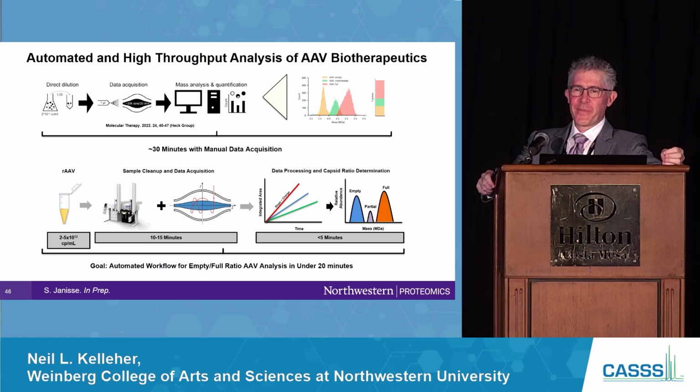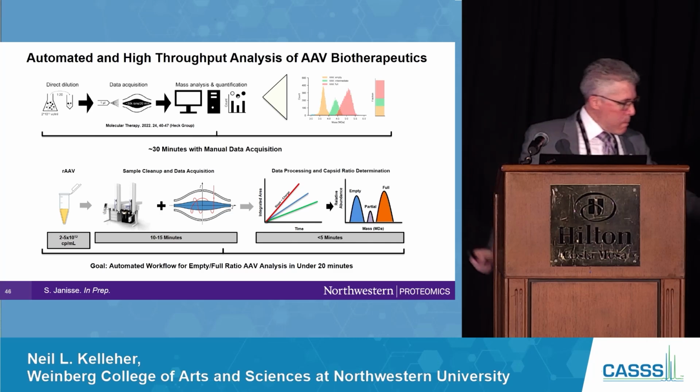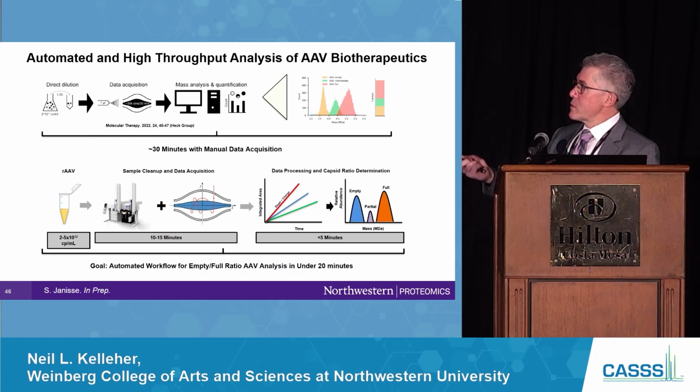Just thinking, because we're on the cusp to potentially have, MAM is a thing now in biopharma, or at least trying to be more of a thing for our friends at the regulatory agencies. And I know empty to full is a tricky slope to do. So I'm just wondering, because it's all well and good when you're academic, you have grad students, this is their life, they can figure it out. But then when you try to roll it out to, let's say, a dev lab that has a specialist, could it then go to a GMP lab that maybe the specialty isn't there, it's someone else, but then QC, could it potentially go there? It was designed for that. This was a joint collaboration with Thermo, launched a year ago, and that's why we did everything we did.